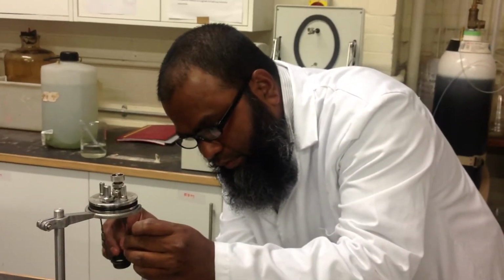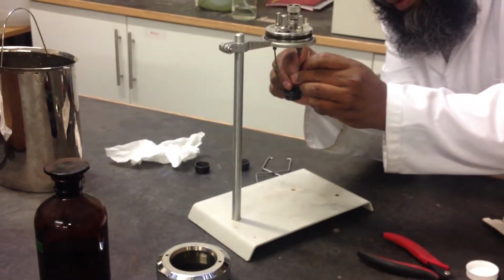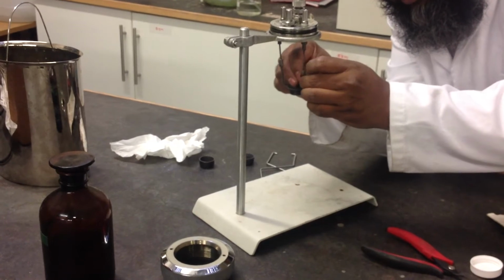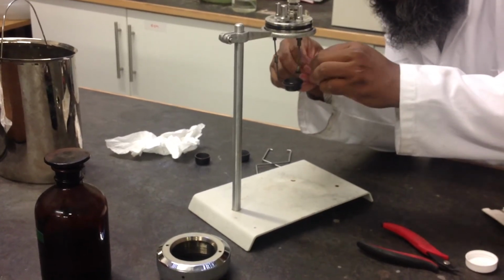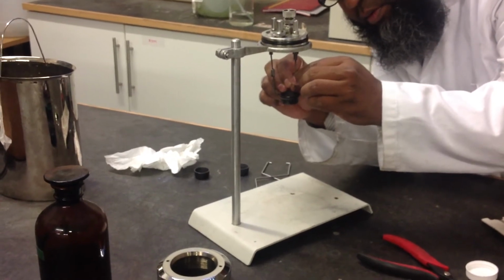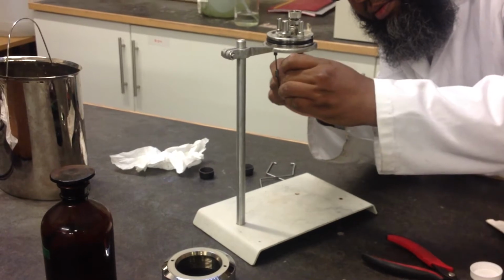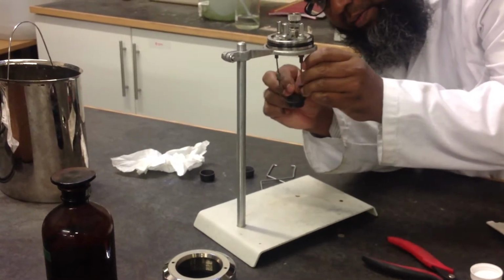You have to connect the fuse wire in between the electrodes in such a way that the fuse wire does not touch the sample. Just pressing the hole.